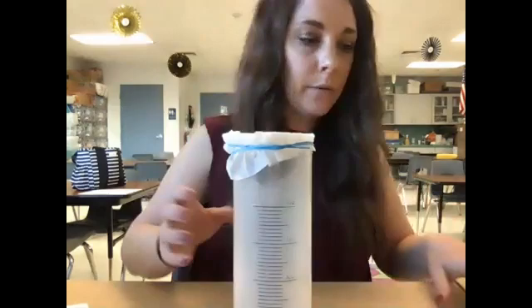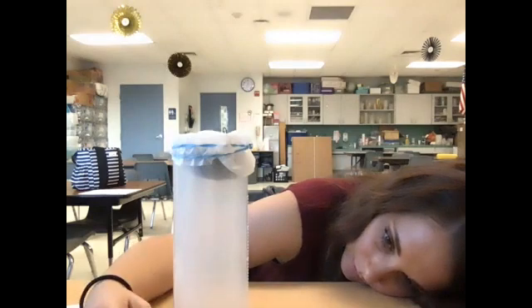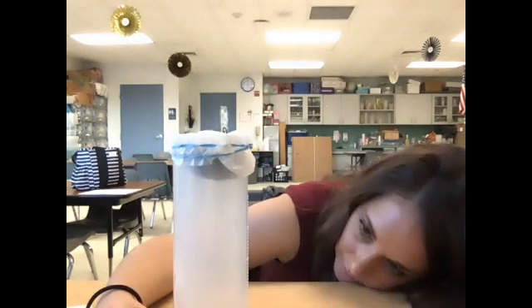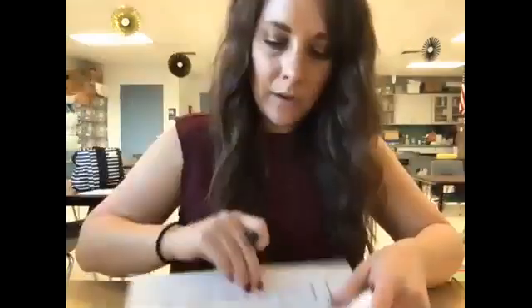All right, that was our 2 minutes. So I'm looking, and in our graduated cylinder, there are 75 milliliters of water. So let's think about this. I started with 100 milliliters of water. There are 75 milliliters of water in my graduated cylinder. 100 minus 75 equals 25 milliliters. So that means my silt is holding in 25 milliliters. So far our clay is holding in 30 milliliters. Our silt is holding in 25.